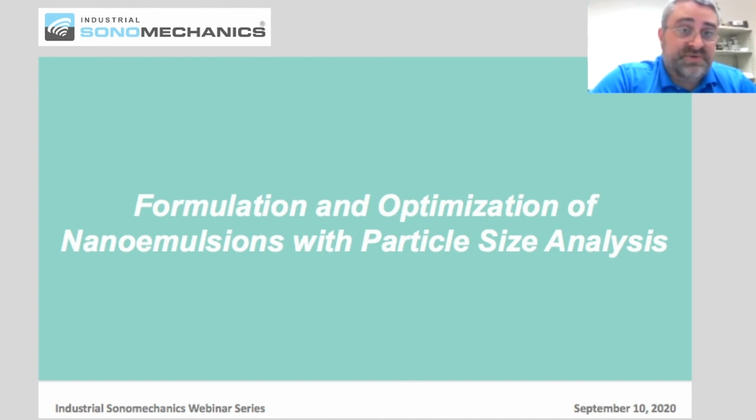You'll still have Brownian motion, the particles will be moving around, and you'll still see scattering fluctuation. But when you look at Mie scattering, which is how laser diffraction works, you're not going to be able to see it very well. So definitely dynamic light scattering is the appropriate technique with translucent nanoemulsions less than 100 nanometers.